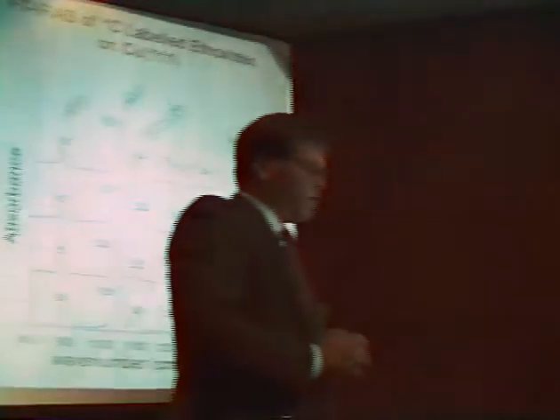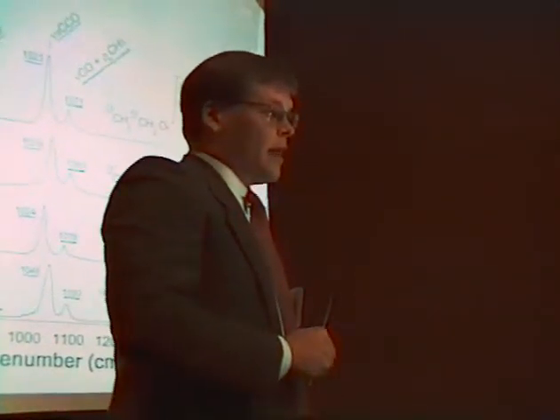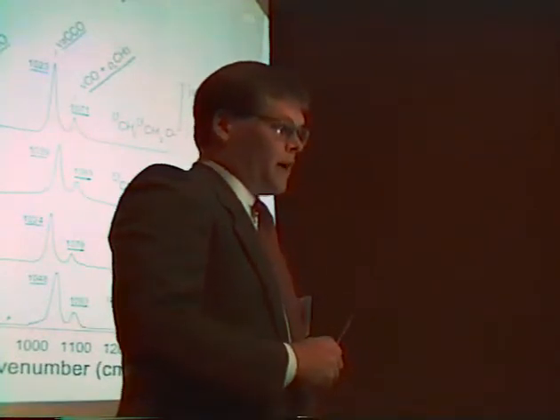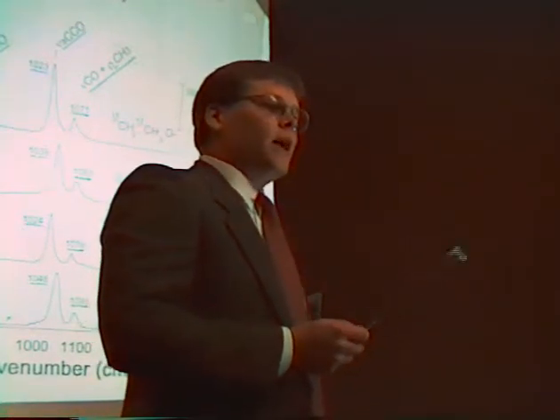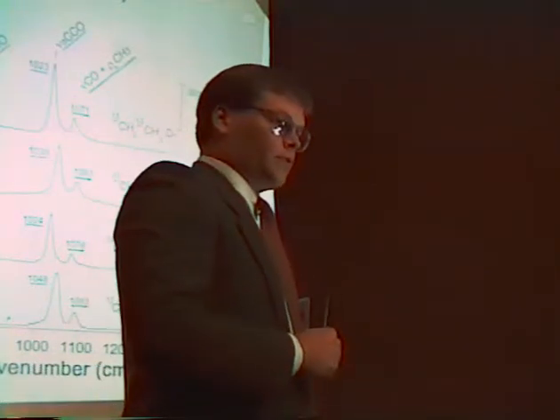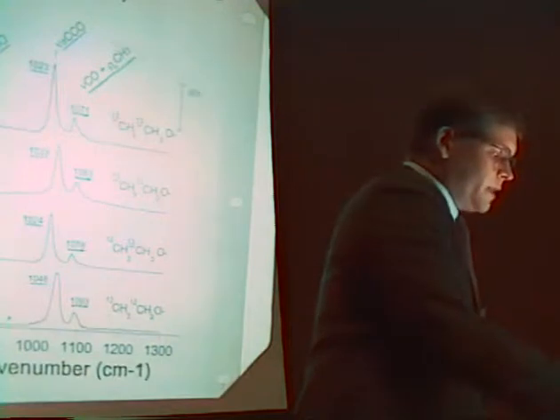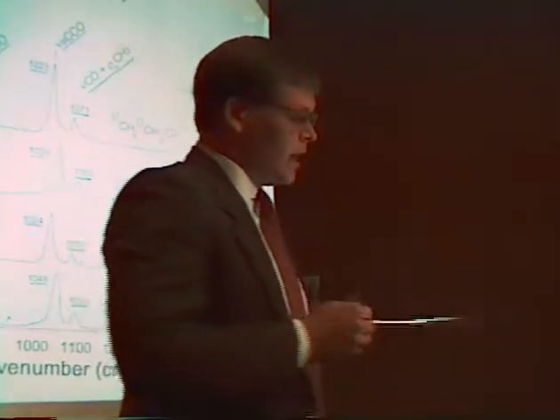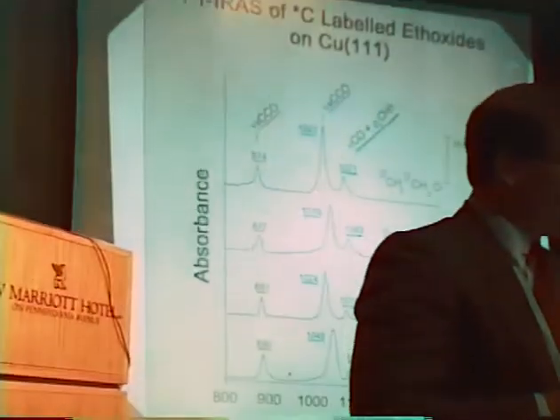So apparently, we can describe these skeletal stretches as they are described in ethanol. That is, the loss of the OH mode doesn't grossly affect the internal structure of the rest of the species, and even putting that ethoxide down on the surface doesn't grossly affect the dipoles associated with the skeletal stretches. We would assign these modes in terms of a symmetric and asymmetric CCO stretch, and a third normal mode of vibration that involves the CO stretch and the in-plane rock of the methyl group.